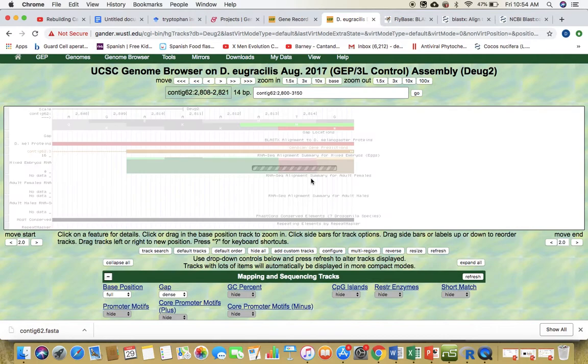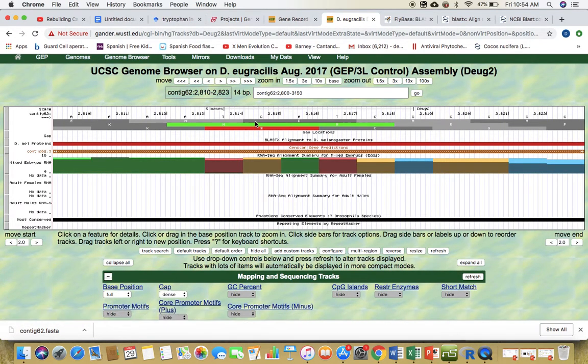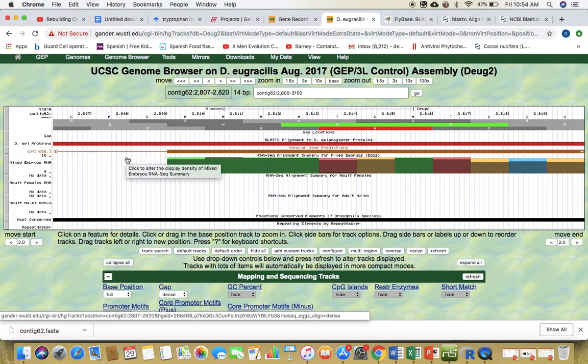So I'm going to scroll and find my first AG site. No AG up here, but I see one. Let's see, this might take a while. AG. There's an AG site right here. There might be multiple others, but this is the one that I'm going to use right now. And you might have to test more than one, right?